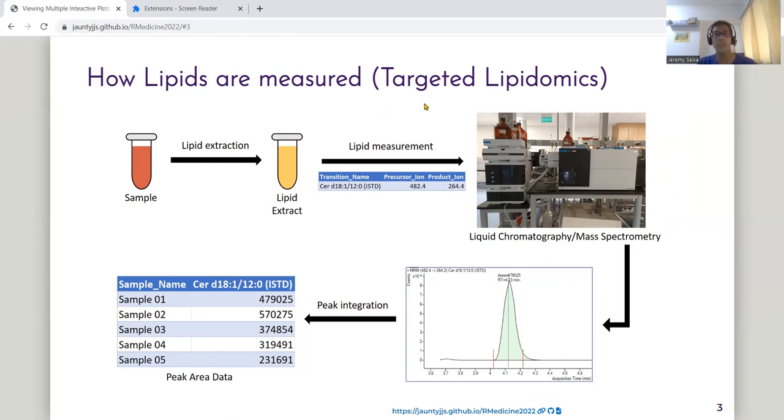Next, we create a list of transitions to tell the machine, the mass spectrometer, what kind of lipids to measure. The machine measures the lipids in the form of peaks given in the range of acquisition time. We integrate the area under the peaks and this is what we have.